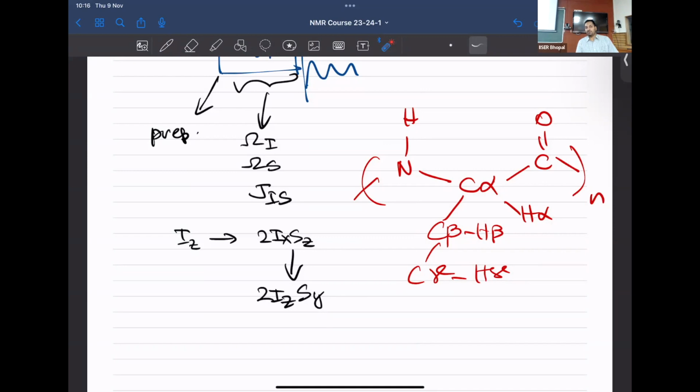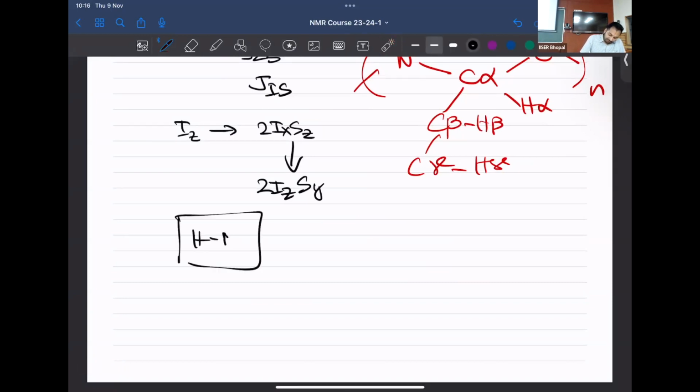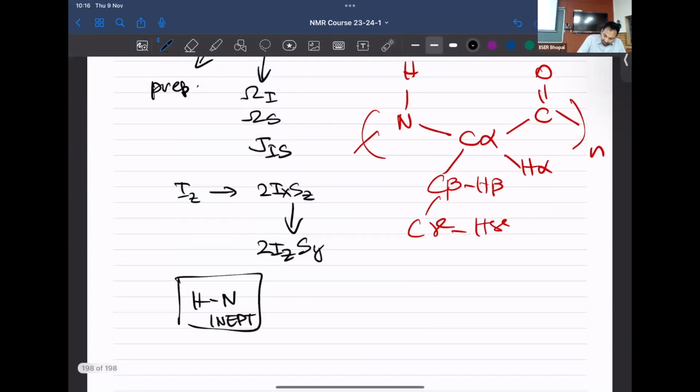Make sense? So that will form the premise of today's class, where we will be looking at some of the three-dimensional NMR experiments and trying to highlight the different concepts that we have learned. And what are the concepts that we have learned? The first part would be transferring from H to N by INEPT. So let's try to take the simpler experiment, where we look at the HNCO.